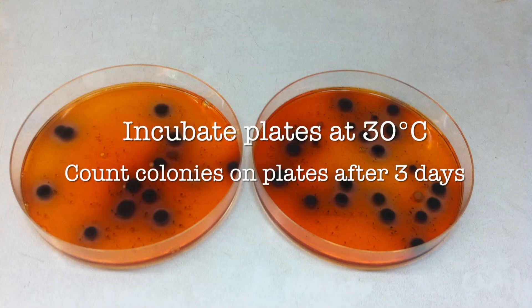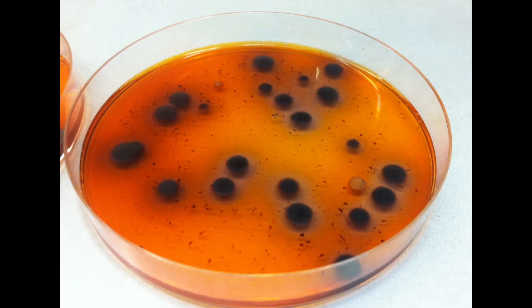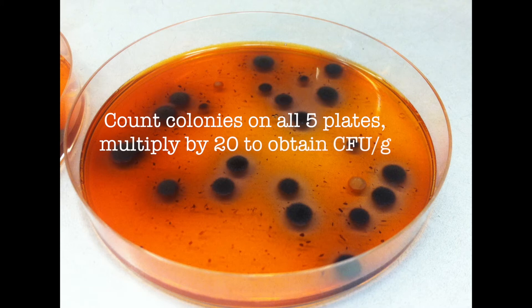After plates have been poured, incubate the plates at 30 degrees Celsius in the dark for three to five days. After this time you can count the colonies of Macrophomina phaseolina on the plates. These colonies will appear gray to black and typically be on the surface of the plates.